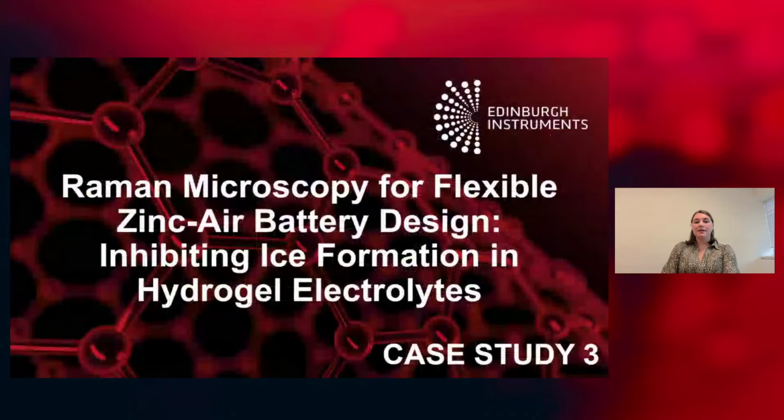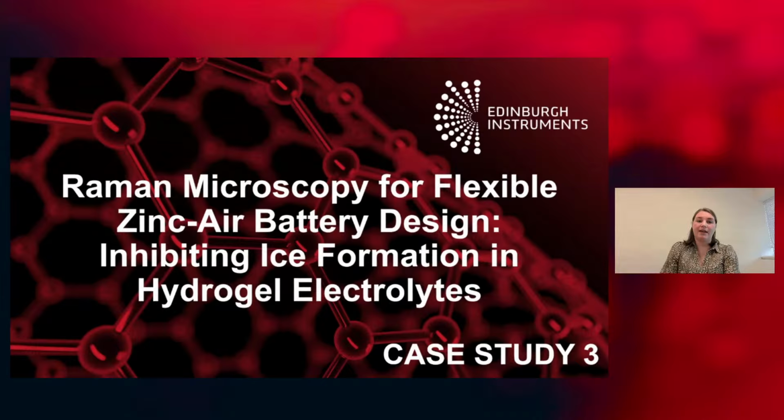Okay, so that brings me on to the third and final case study. We've looked at operando measurements as well as imaging of the electrode. Now this study is looking at the composition of an electrolyte, and in particular, how that electrolyte can be changed in order to inhibit ice formation.